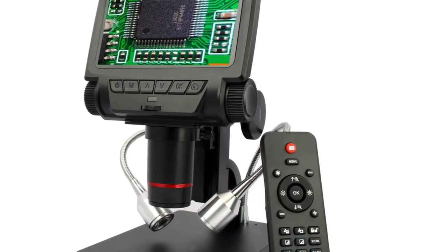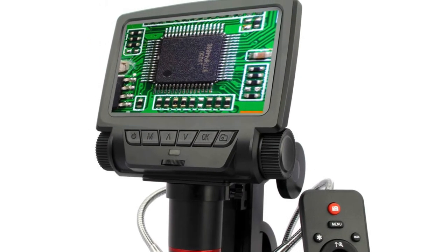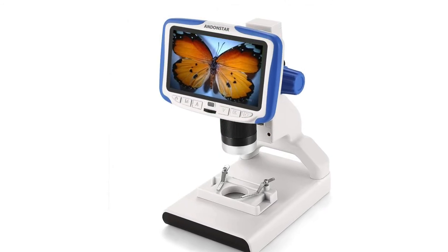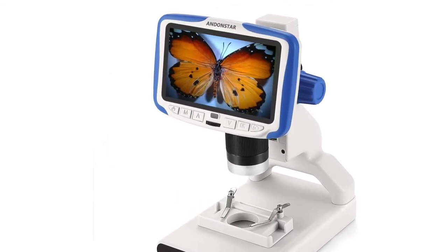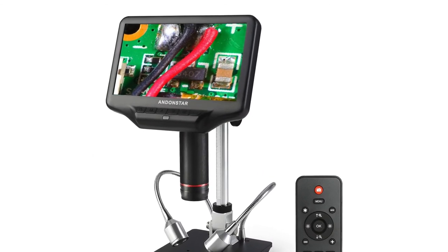What I'd really like to get my hands on is a microscope like this one from Andon Star with its own screen. The cheaper versions come with USB connections, but if you pay a little bit more you can get HDMI output in glorious 1080p resolution.